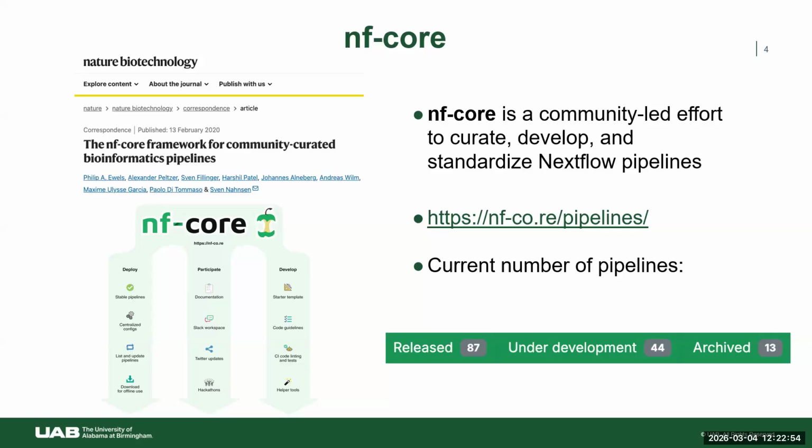And one thing I want to say about NF-Core is that all NF-Core pipelines will be developed using Nextflow. But not all Nextflow pipelines will be NF-Core pipelines, because to be an NF-Core pipeline, you do need to follow the NF-Core practices. It doesn't mean that non-NF-Core pipelines are not good. There are plenty of really good examples of very good Nextflow workflows that are not part of the NF-Core community, but that is one distinguishing component there. You can make a Nextflow pipeline however you wish. But to be part of NF-Core, you need to involve NF-Core early on so that those requirements are clear.